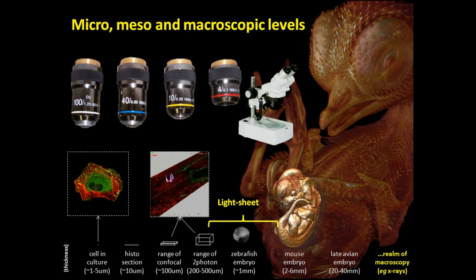And then we step a little bit more into another order of magnitude, into the light sheet realm, where you can actually image whole zebrafish embryos. Zebrafish are very transparent embryos that develop easily in the microscope and show us within 24 hours the full development of an organism. And light sheet is just appropriate for that. It shows us in great detail what goes on inside the embryo.